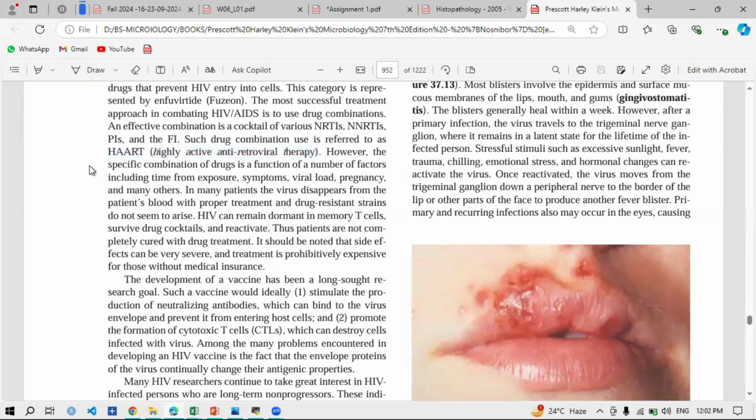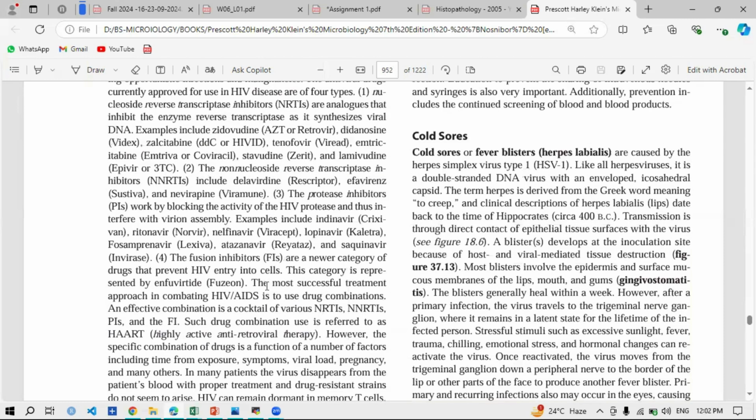In this paragraph, the information related to HAART therapy is included, and you can easily access it and tell your professor what HAART is, how it is performed, and the knowledge related to it. So in order, you get that word, go to the index, quickly search out the word, find the page number, quickly go to that page, and extract the information related to HAART therapy. So basically, this is indexing. We are also performing indexing for our genome.